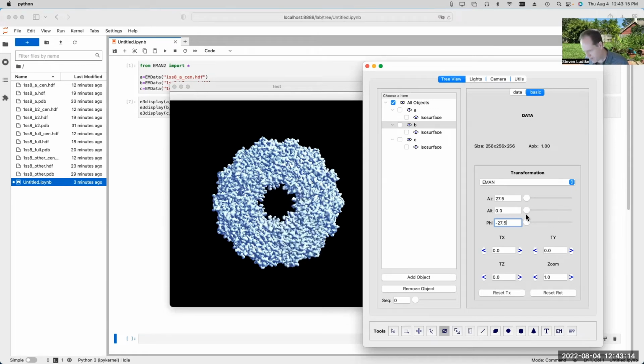Okay, so that's not too bad anyway. Now it's kind of rotating towards the middle, and you can see we're still going to have some intersections between various parts of the structure as it rotates like that. But maybe that's all right. We're just doing image processing here, so we don't really care if it's a perfectly good molecule. A little bit of error there is fine.